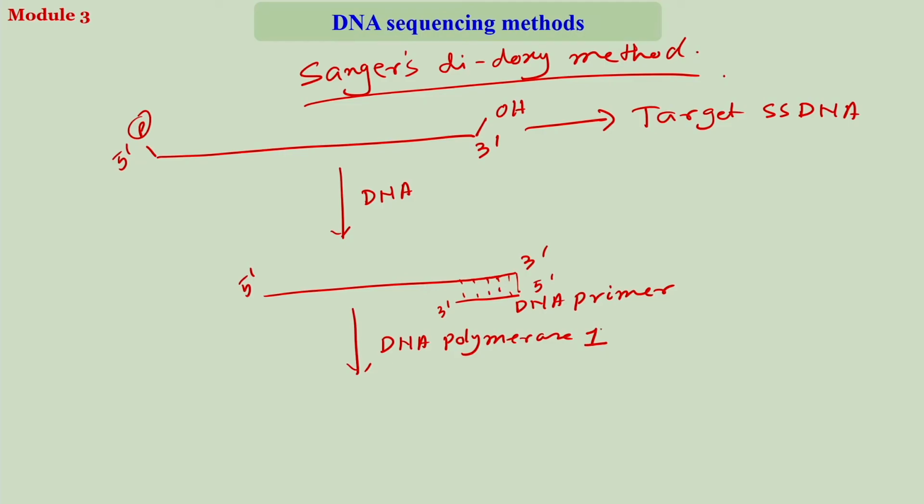So, they used the normal DNA polymerase, and since they are not using heat, since they are using only the single stranded DNA, the normal DNA polymerase works fine. And of course, you have to remember that all of these things happened before PCR was developed. And plus, if you now add the dNTPs, Sanger has also used all the 4 dNTPs.